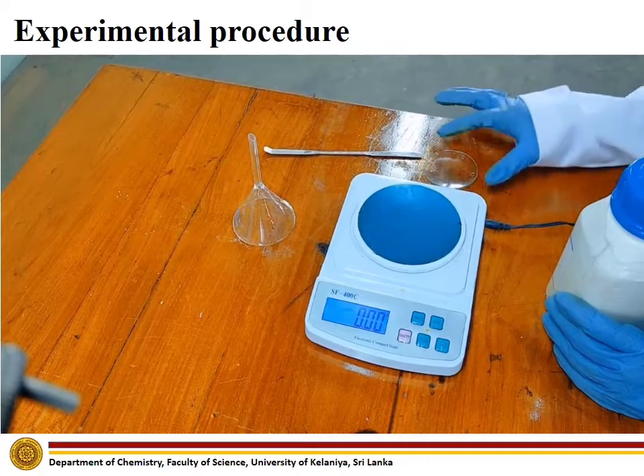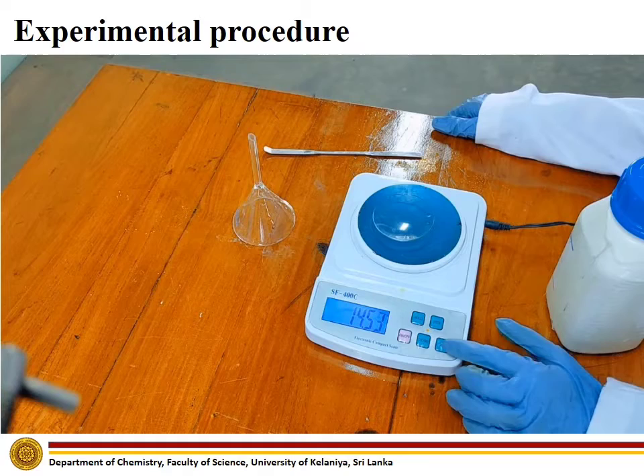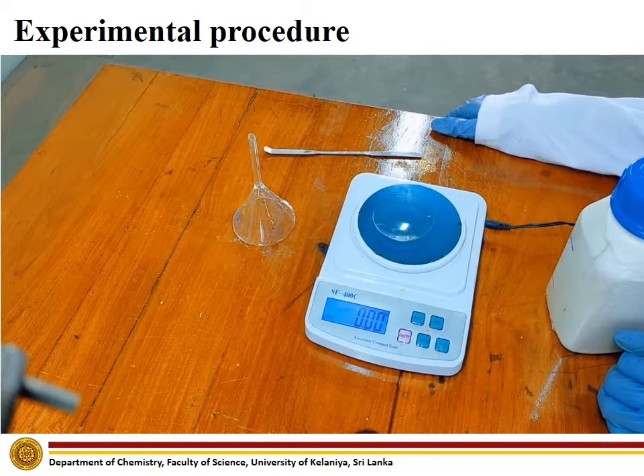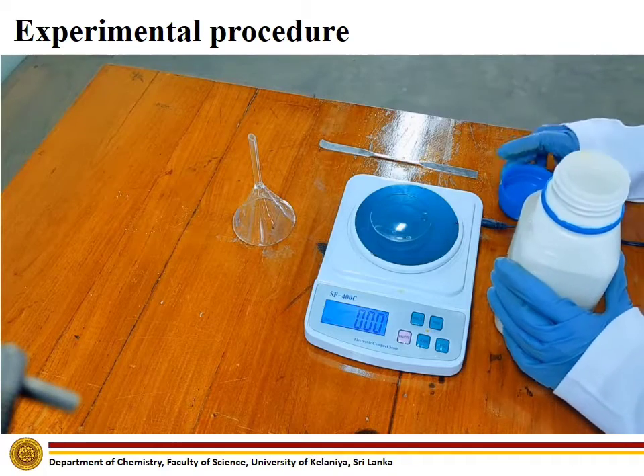First, place the watch glass on the electronic balance and set the reading of the balance to zero. Next, measure 26.5 grams of solid sodium carbonate.